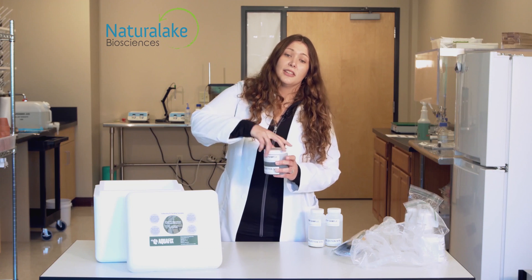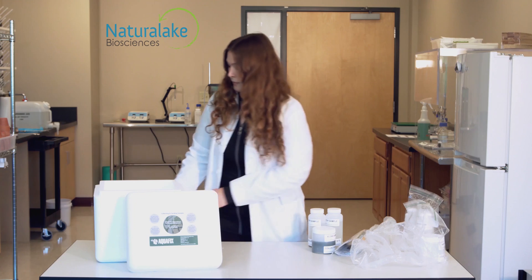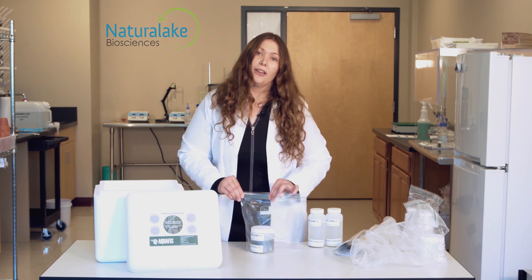Make sure to twist the lids tightly. Place your sample jar and sample bottles in a resealable bag, making sure they remain upright and expel excess air.